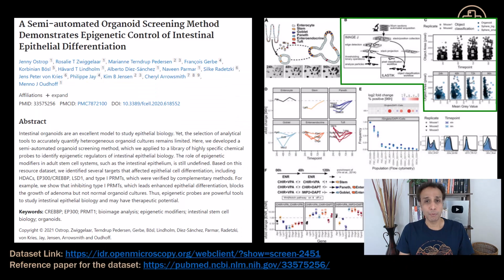Okay, now let's move on. I didn't intend to talk for a couple of minutes, but hopefully that provided a good background. We're not going to replicate this paper, but I was just reading this and I'm like, oh, public data set, great, let's go ahead and get it.